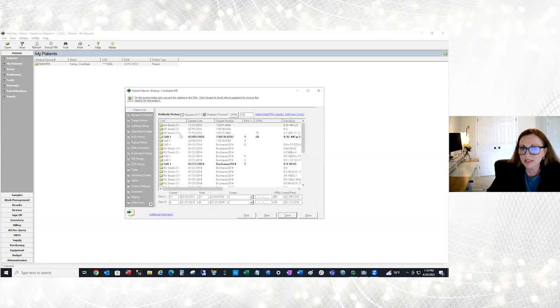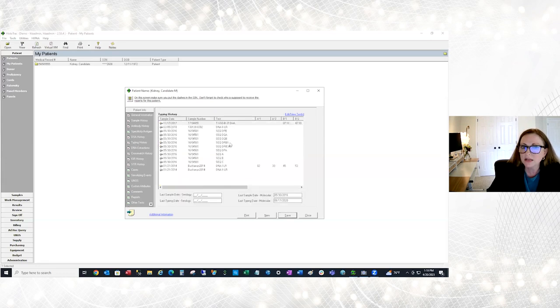And so what's nice about this is it breaks them down based on the fields that are needed for the various tests. So antibody tests have definitely different fields that are needed than a typing test. So by separating these out, we're able to give these fields on the screen some uniqueness to the test that you're performing. You are able to customize the view, so each user could make these columns in their own order or own filtering.